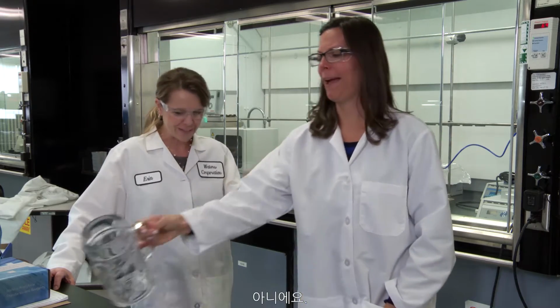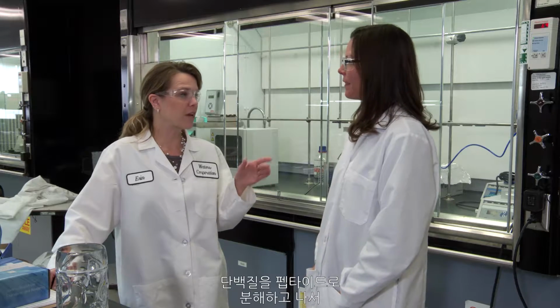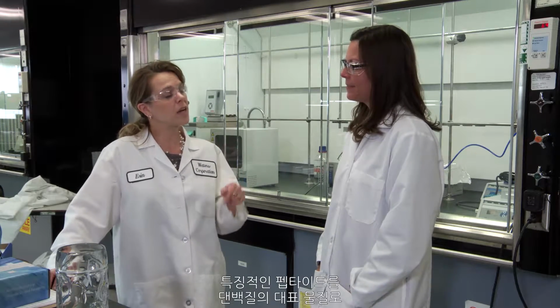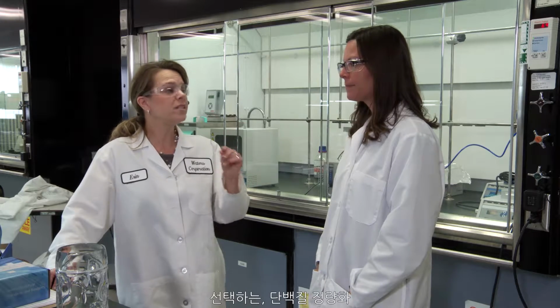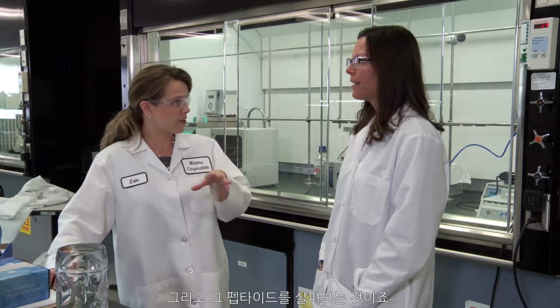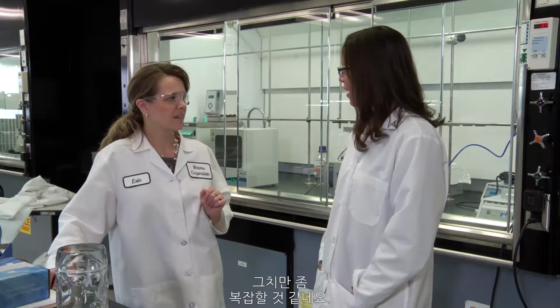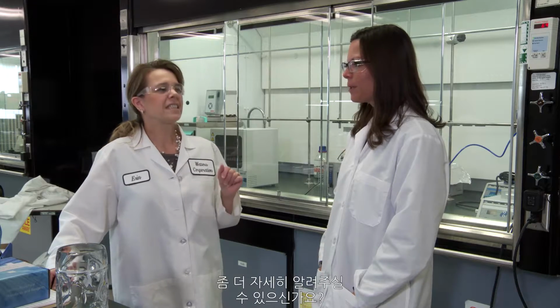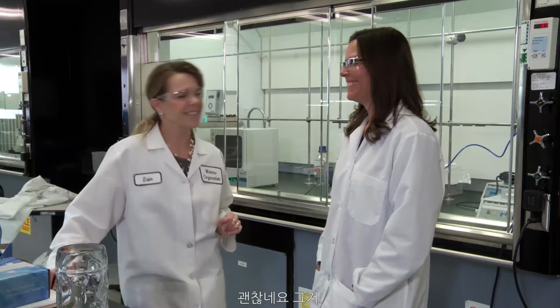What we're really talking about here is a method of doing protein quantification whereby we digest the protein into its peptides, and then we select a signature peptide as a representative for the protein, and we monitor that peptide. Does that make sense? It does make sense, but it sounds a little complicated. Can you show me this in more detail? Yeah, perhaps it's better if I draw it out for you. That sounds good.